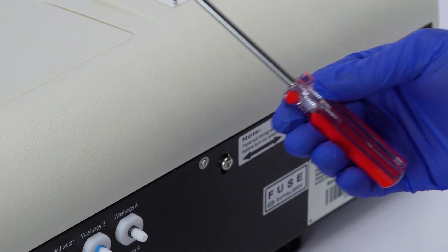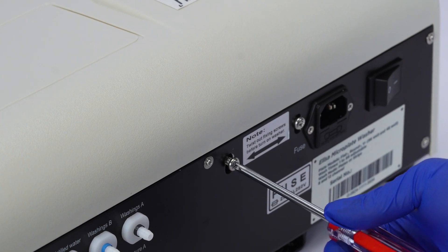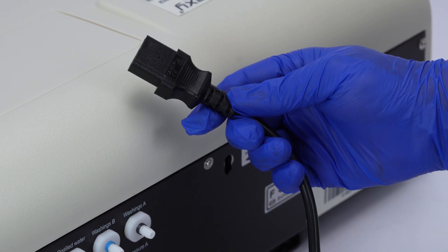Before starting, use a screwdriver to remove the safety screw from the ELISA washer and attach the power cord to the machine.